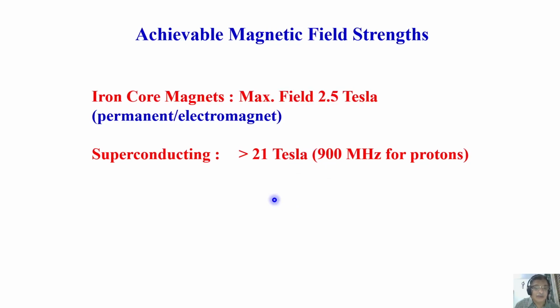They will be commercially available. So spectrometer frequency is going up and up. As a consequence, the magnetic field strength is also very high. To generate such a magnetic field takes an enormous amount of research. We cannot just generate a magnetic field so easily, just because we know the superconducting nature of a certain material, and then make it superconducting, pass current, and generate the magnetic field.